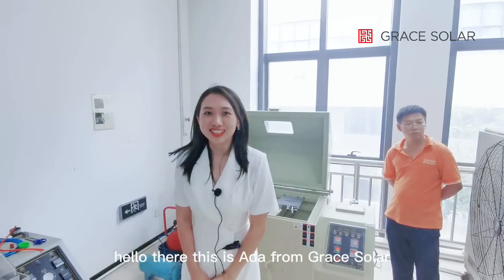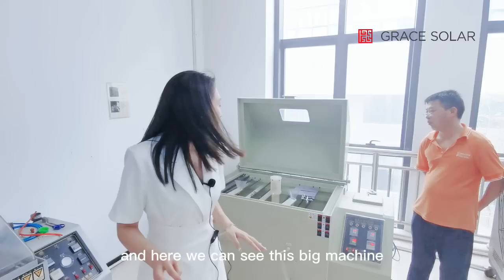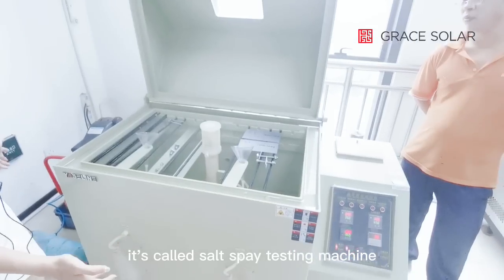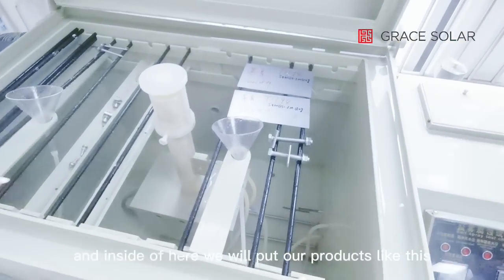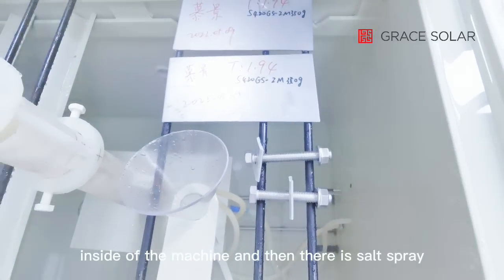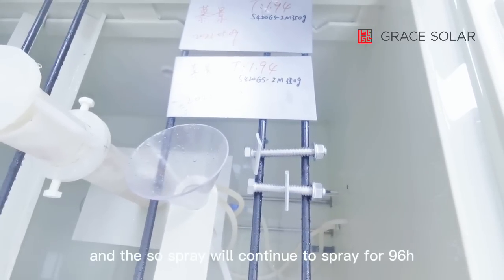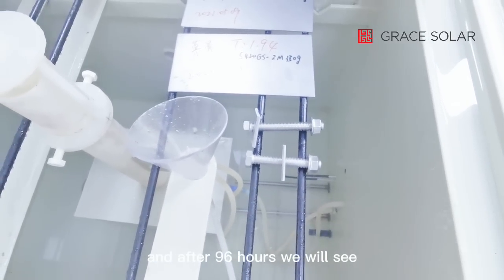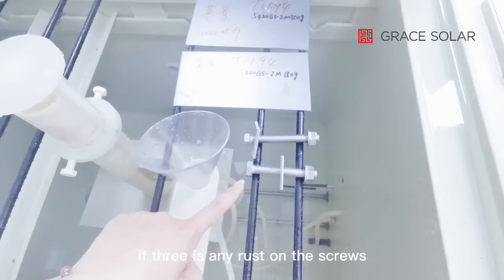Hello there. This is Ada from Grace Solar. We are at the lab in the factory and here we can see this big machine. It's called a salt spray testing machine. Inside we put our products, and the salt spray will continue to spray for 96 hours. After 96 hours, we check if there is any rusting on the screws.